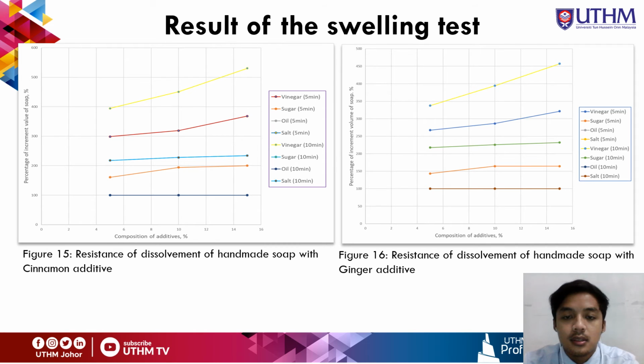Okay, so these two figures show the resistance to solvent between the two additives, which are the cinnamon additive and also the ginger additive.